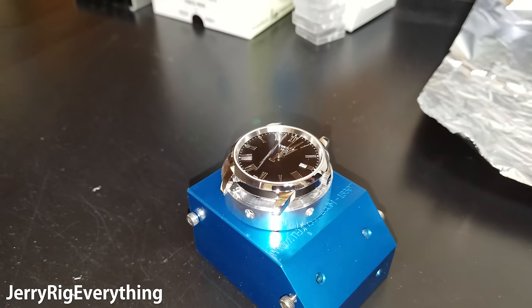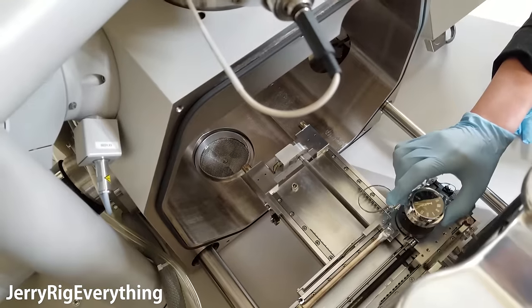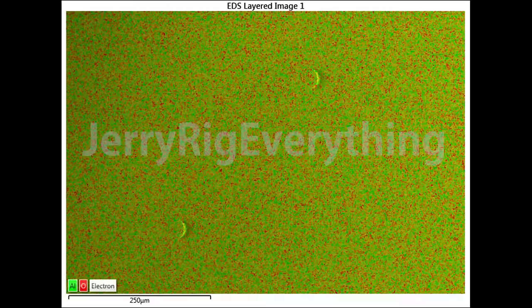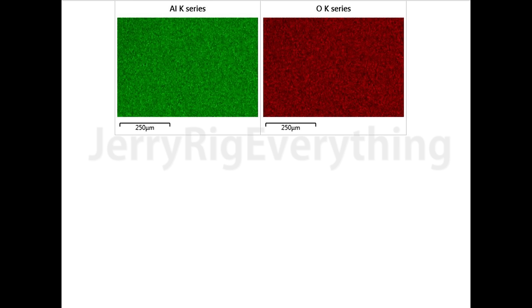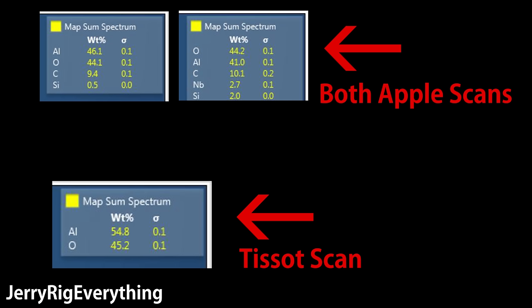Now let's take a look at the elemental analysis of the sapphire crystal on my Tissot watch. The only two elements found on the surface in the scan are aluminum and oxide — no carbon impurity. Also, the ratios of the Tissot sapphire are very different from Apple's: Apple only has a 2 or 3 percent difference between the aluminum and oxide, while Tissot has an almost 10 percent difference. I'm not a chemist, geologist, or engineer — I personally graduated in business — but these numbers are very interesting between a lens that does fracture and a lens that doesn't.